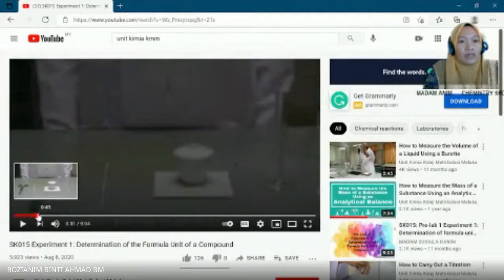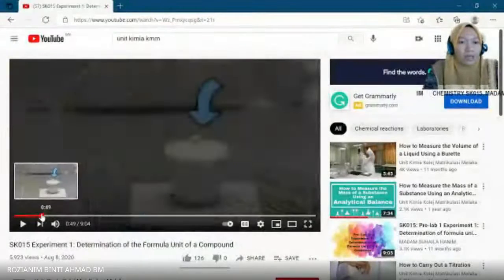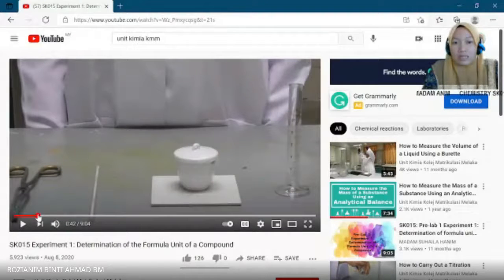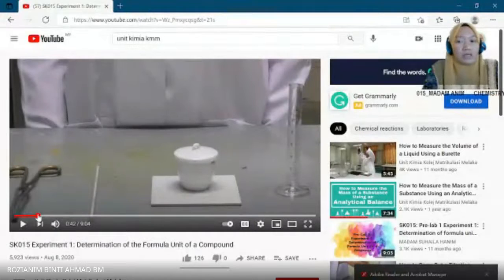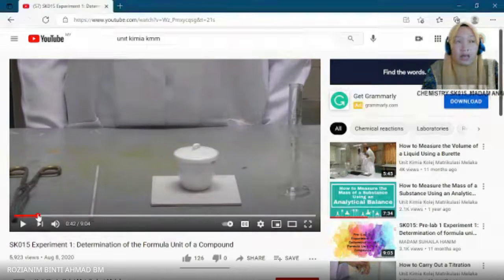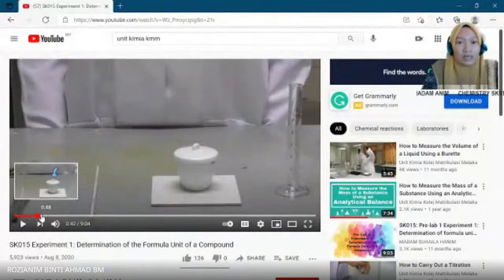During mixing, you can refer to procedure number 3 and number 4. When hydrochloric acid is mixed with the zinc powder, the gas bubbles should be released. This procedure should occur in a fume cupboard, because if you read page 2 of the lab manual, the gas produced, which is hydrogen gas, explodes easily if fire sources are near.